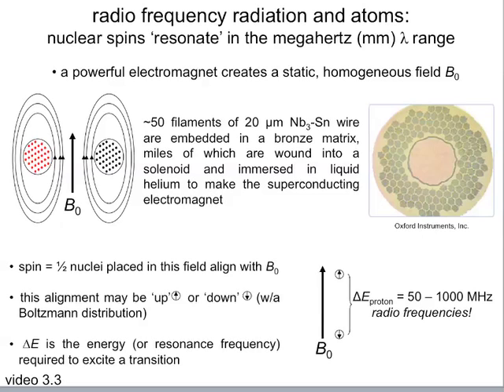So there's a lot of information on this slide, and let me just break it down for you. Every atom has a quantum characteristic known as its nuclear spin. Now, it's not a spinning top, but it's easy to visualize it as a spinning top spinning with some frequency. And when we hit that spinning top with radiation in the appropriate wavelength range, the spins resonate. And it's that resonation, that ringing of the spin, that gives us our NMR signal.